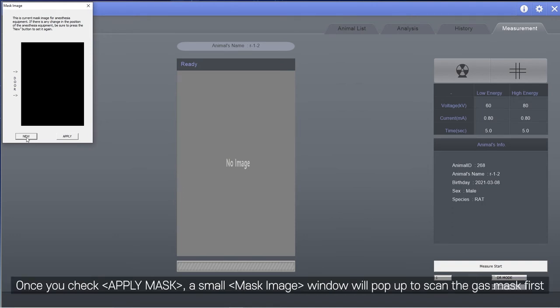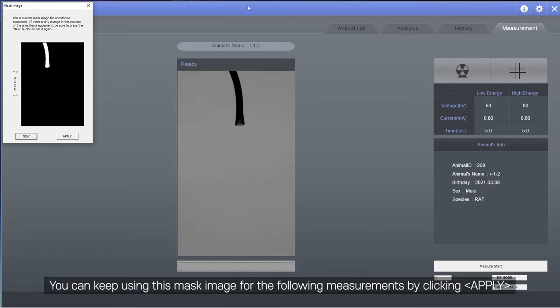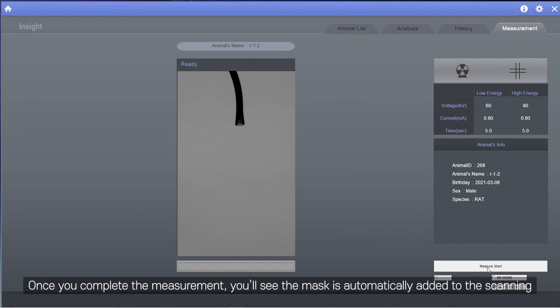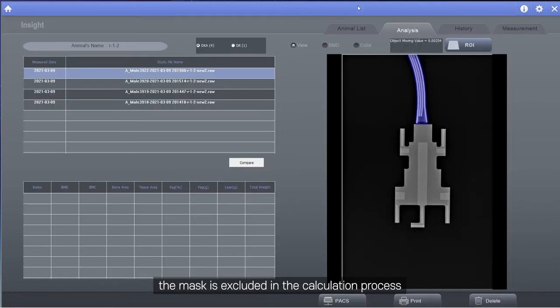Once you check Apply Mask, a small mask image window will pop up to scan the gas mask first. If you see mask image window, fix a gas mask on the tray, close the door, and scan the fixed mask by clicking New. You can keep using this mask image for the following measurements by clicking Apply. Once you complete the measurement, you'll see the mask is automatically added to the scanning and highlighted in purple in analysis window, which means that the mask is excluded in the calculation process.